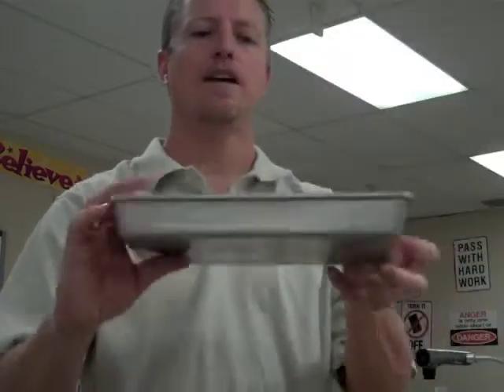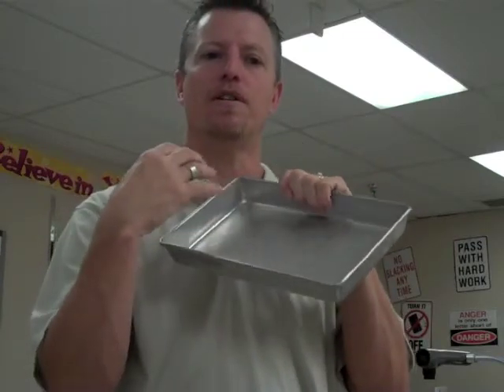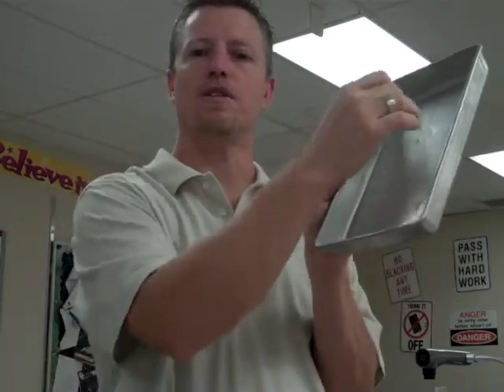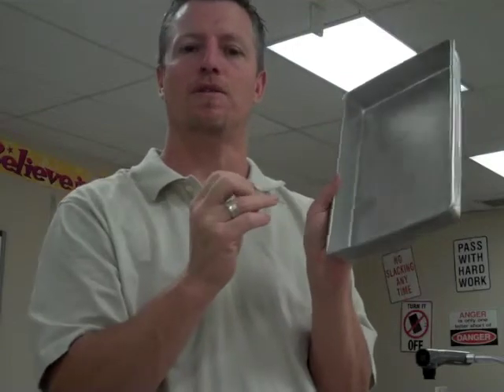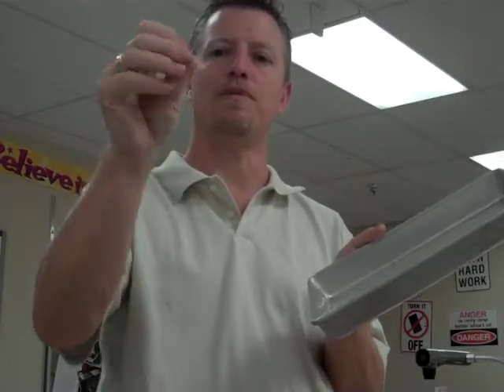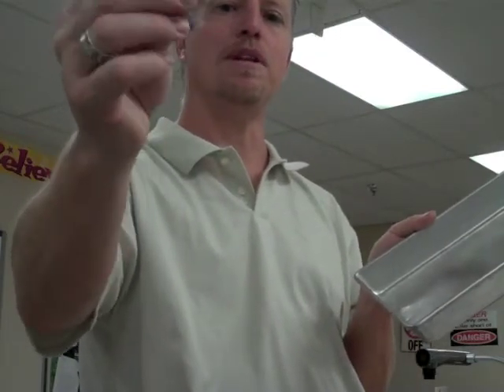This is a dissection pan. Some pans will have wax or rubber in them, and that allows you to put pins into the skin or muscles as you move them back to get into the internal organs. This is actually a dissection pin — a lot of people say it looks like a nail, but it's not as big as a nail. It's more like a really strong pin.